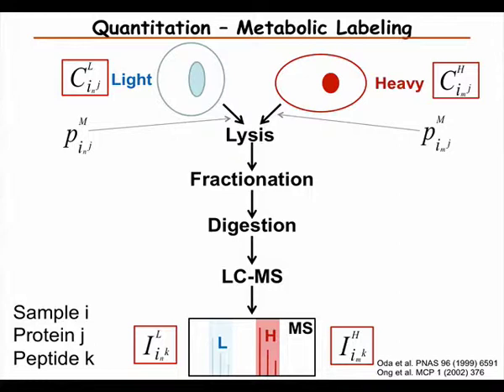So now these are just 2 different ways, but then, as you can imagine, people have thought about introducing labels at every step in between here. So you can label the proteins, you can label the peptides, and so on.